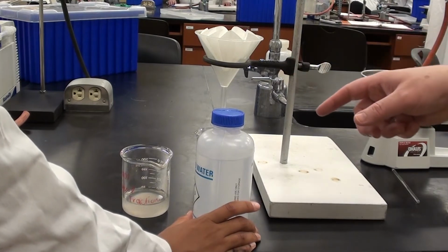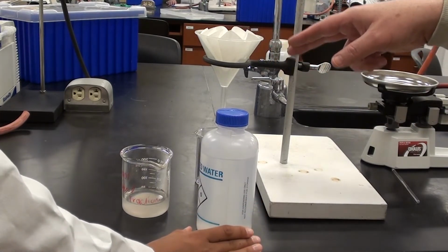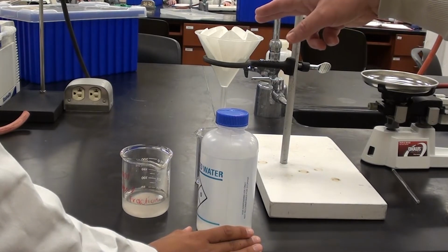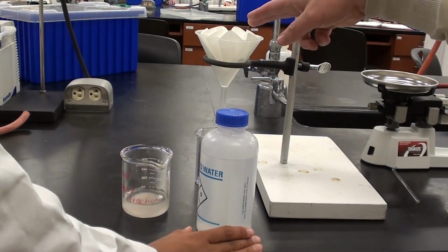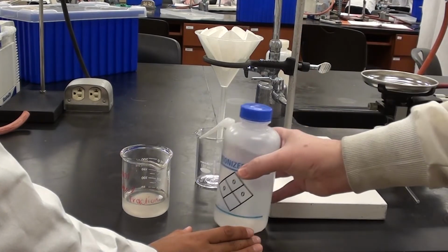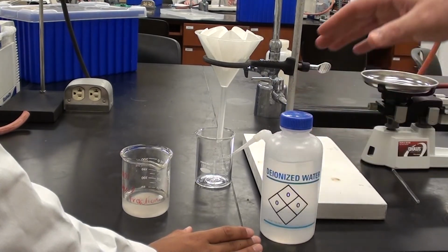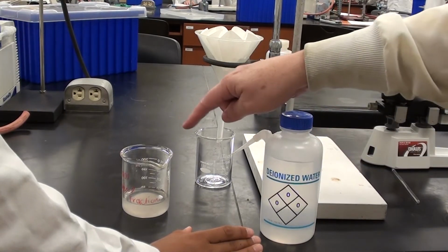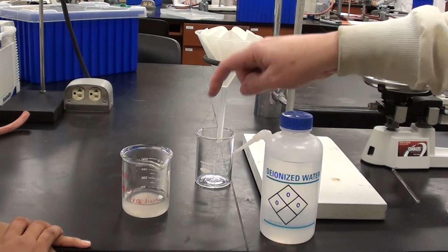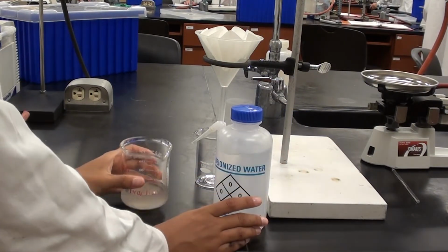The technique that Sabrine is going to use is she's going to swirl it as quickly as she can, and then she's going to pour it in here as quickly as she can without losing any, and then she's going to rinse out her beaker with some DI water to make sure that she gets every last skerrick of sand out of the beaker. Alright, Sabrine, let's see you do it.